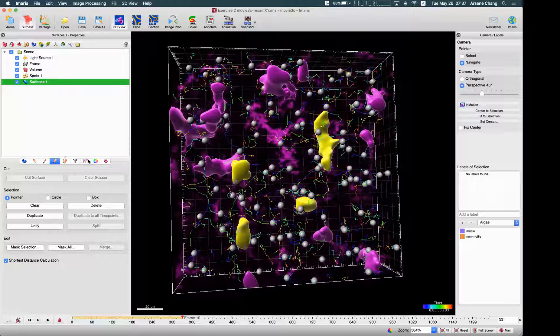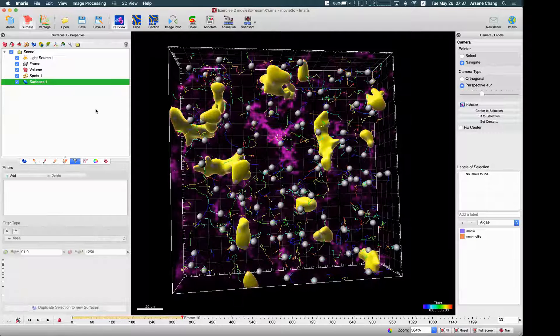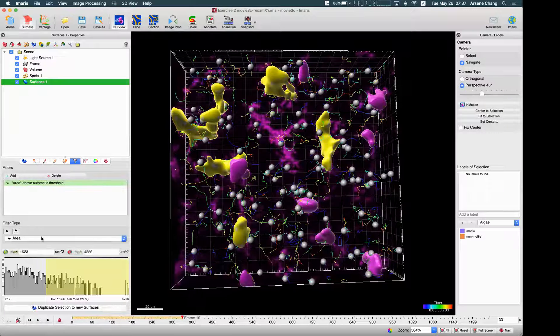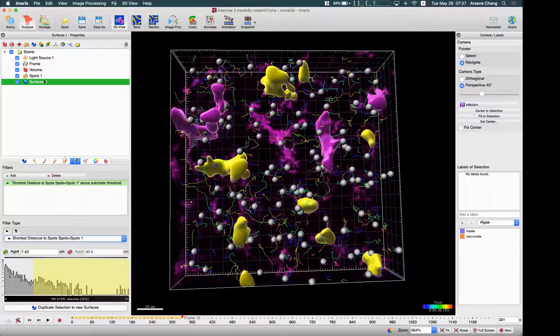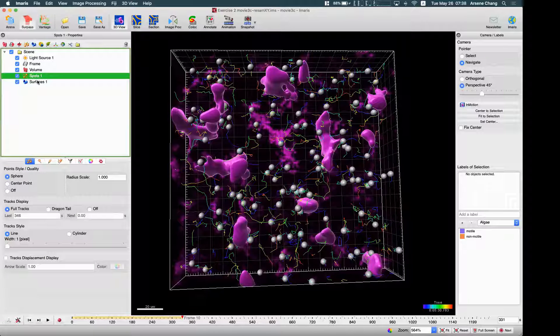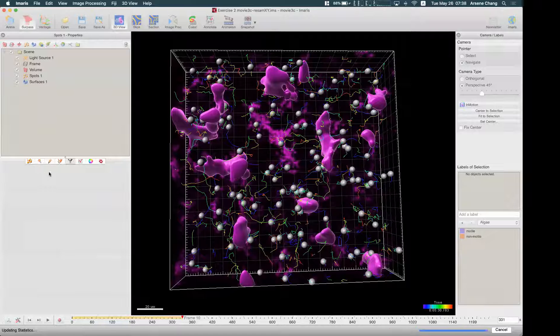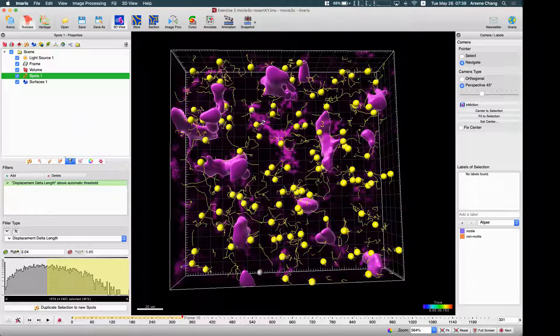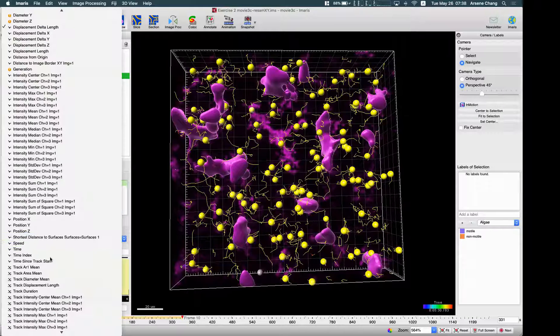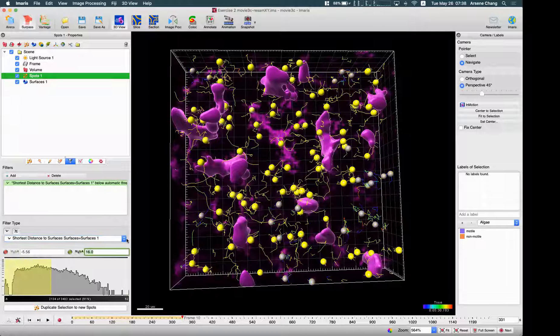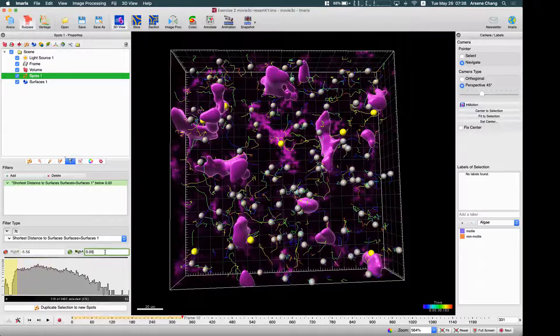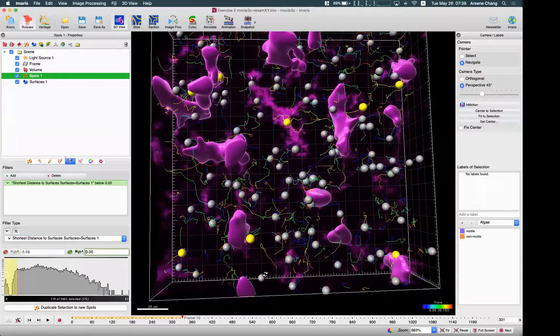Go to Filter, then you can add a filter — but actually, you should go to the Spot and go to Filter and Add, because you want to count the number of spots, not the number of surfaces. So go to Spots and use the 'Shortest Distance to Surface'. Then turn off the minimum and set the maximum to zero.